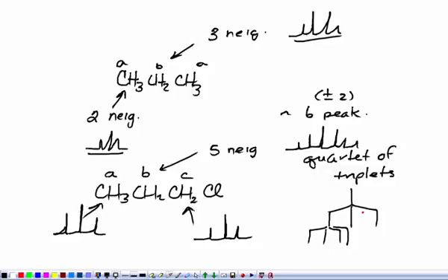But the one thing about these complex splitting patterns is they tend to be clean. In other words, you'll see symmetry around the peaks. If you see peaks that don't look symmetric, it's because you have 2 distinctly different hydrogens that are now overlapping. So as we go through spectra next week, we'll see some where there's a nice clean pattern, we'll see others where there's not. Okay? But that's what happens if you're a hydrogen in between 2 non-equivalent groups. You suffer from complex splitting.